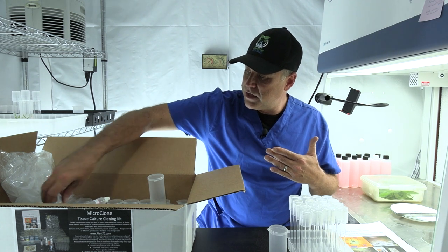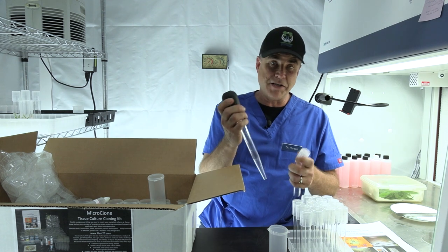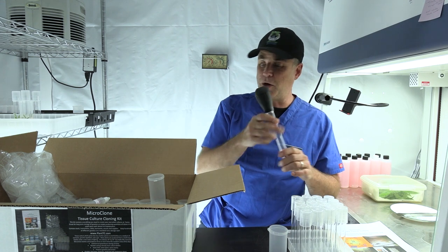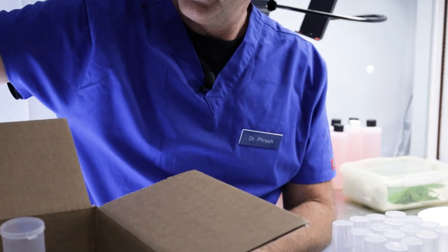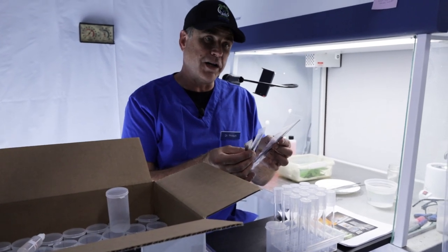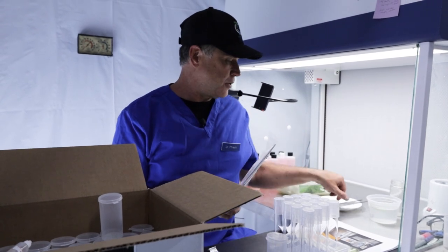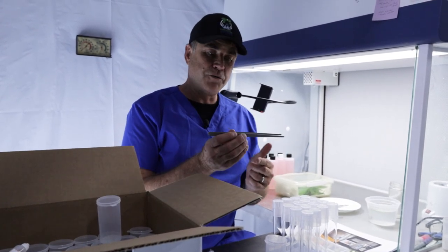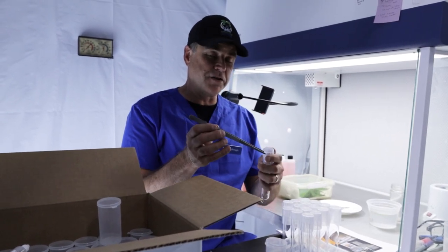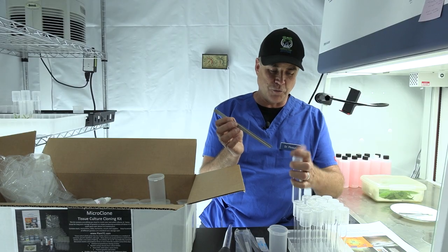We've got all the small components in the kit: a turkey baster, which is fantastic for filling these tubes after you mix everything up. Scalpel, forceps, and blades. We've got these wonderful eight-inch forceps, and we learned to use those from back near the hinge so that we can reach down into containers like the test tubes and plant things and remove them without touching the rim.